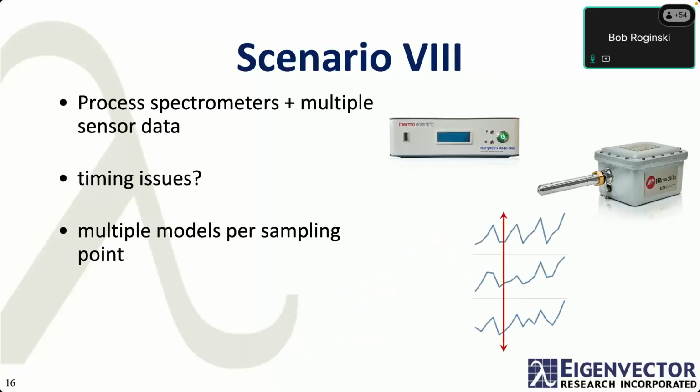So a couple of process spectrometers, and in that last graphic, what I'm trying to imply is that I've got 3 univariate measurements that I will take a snapshot in time of, get the values from each of those 3 sensors, combine those with each of the spectroscopic measurements, and that's going to be the input to my model or models.